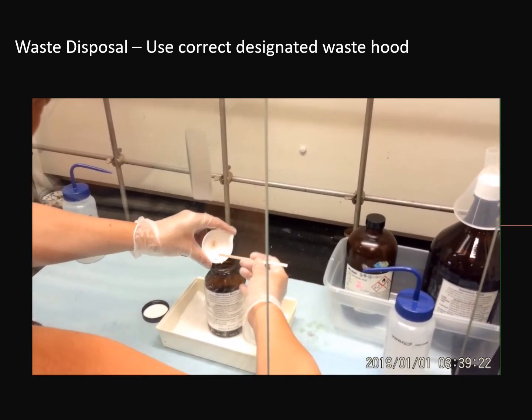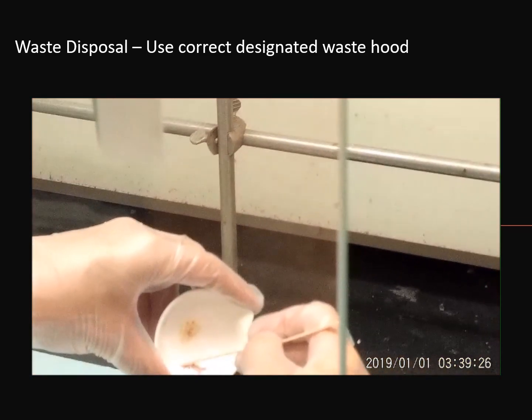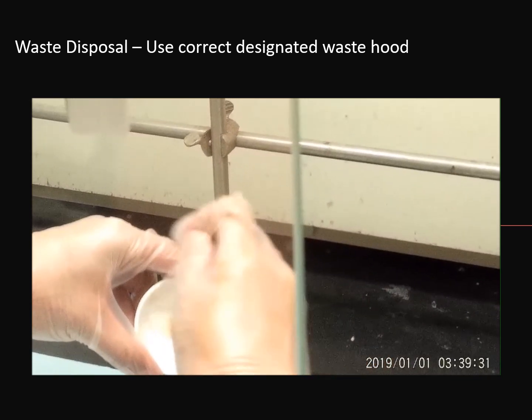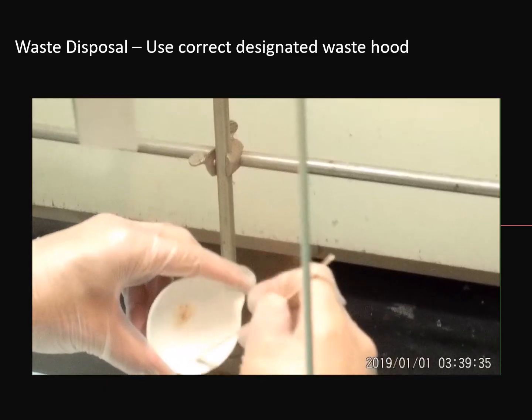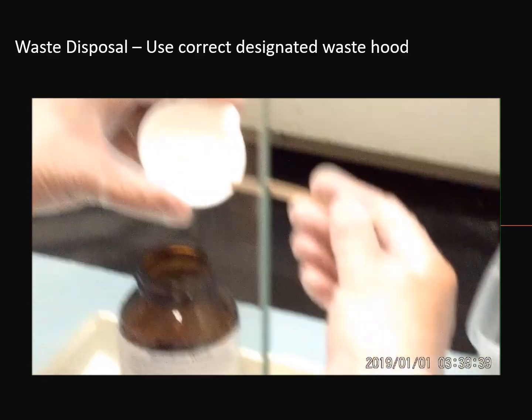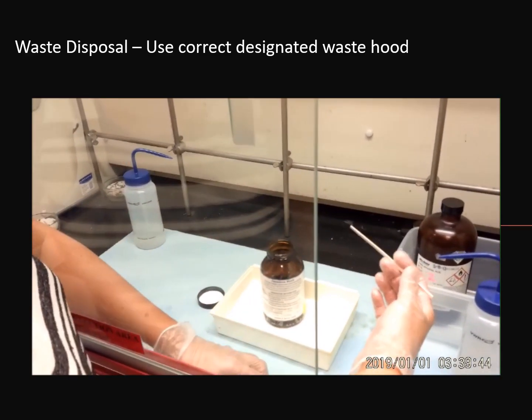As you can see, we did a little bit of overheating, so it's turned brown because we're beginning to get a little bit of decomposition from too much heat. Just scrape it in. Now that we've done that, we don't need to wash here. All we're going to do is take this back to our sinks, wash it, and return it.